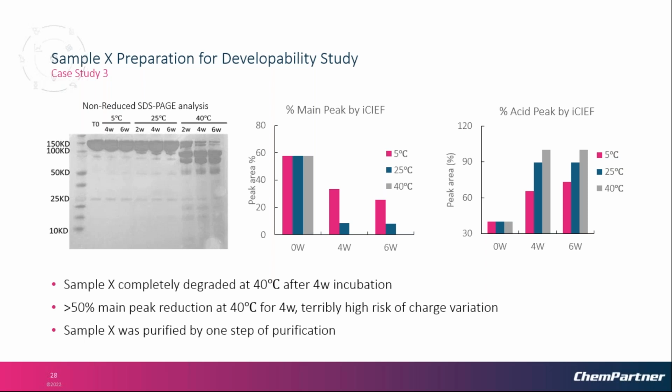In addition to this successful work, we also gained some useful experience from failure. From this study, we could see that the pre-preparation process of the samples is often neglected, but we found that if you didn't handle it well, sometimes a big problem may arise. In this study, we found that the stability of the sample X is very terrible. From the left picture, we can see that after 4-week incubation at 40 degrees, the sample X completely degraded.